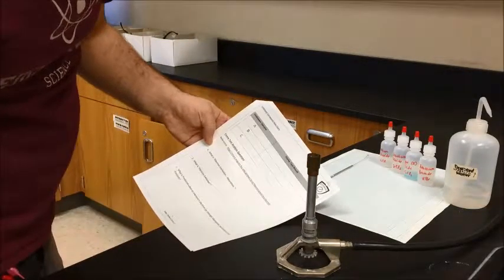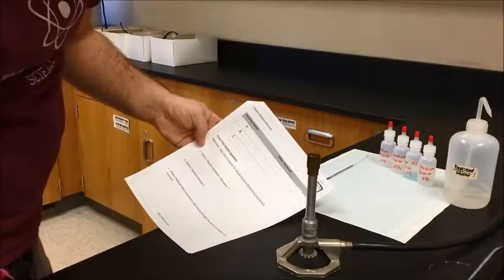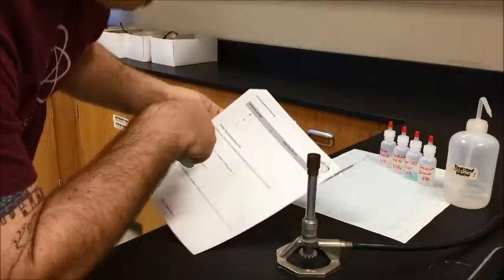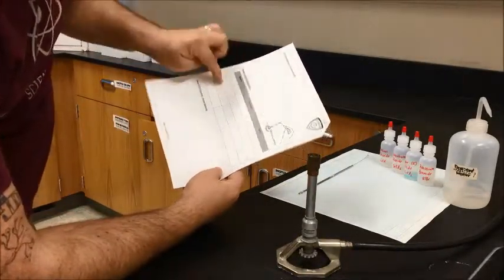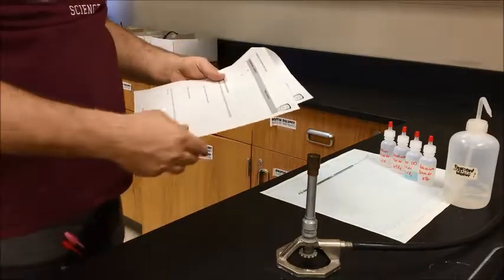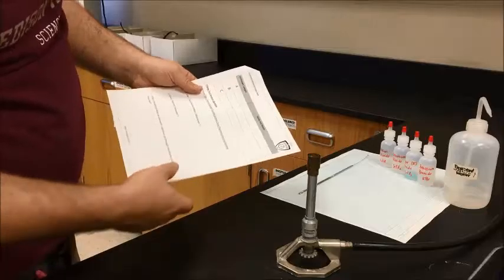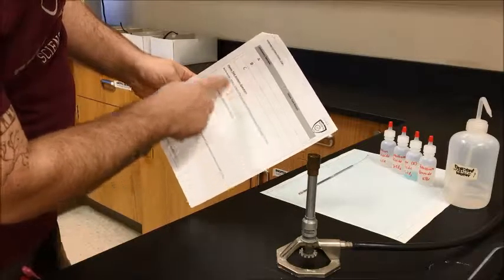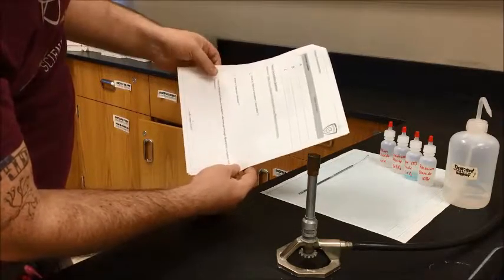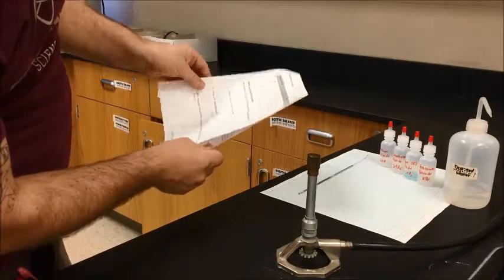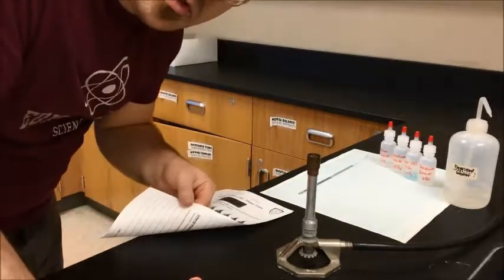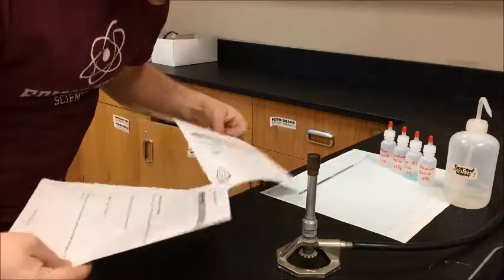Then you'll go on to the unknowns. And these are labeled A's, B's, and C's, and stuff like that. And the flame test result, you'll want to write down the color that you observe because then you'll be able to match the knowns to the unknowns and identify the unknown chemicals, which is, of course, the overall purpose. The analysis questions involve a reference, so you might want to look that up. It goes into excitation and emission. We've got a few Regents-level questions and our typical CEI. So I verbalized to you the procedure, but now I'm going to show it to you. I've got to go turn out the lights.